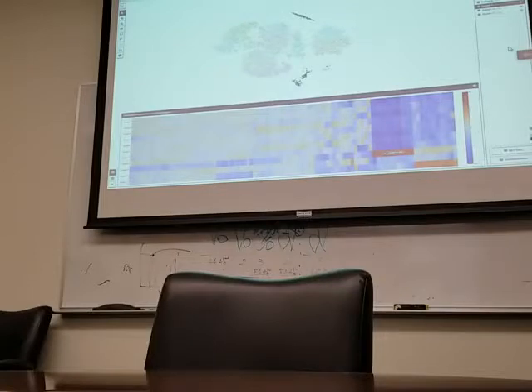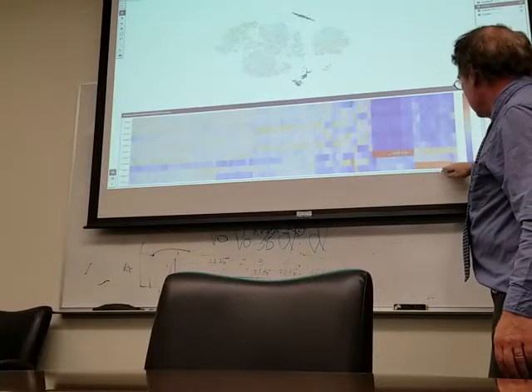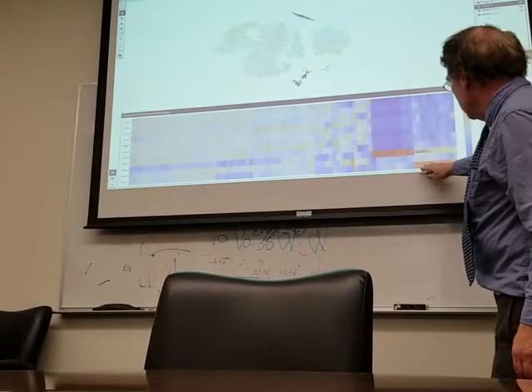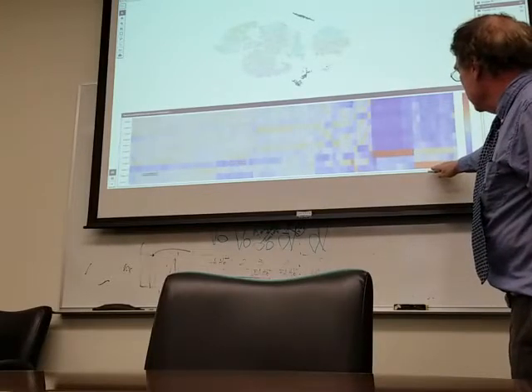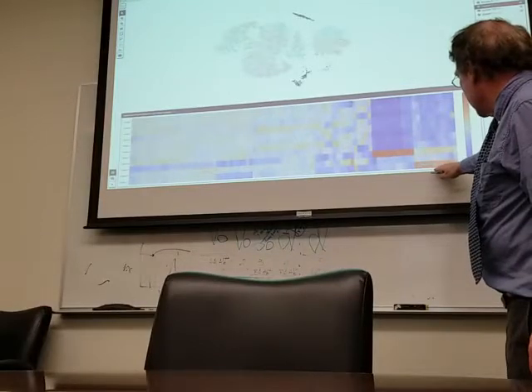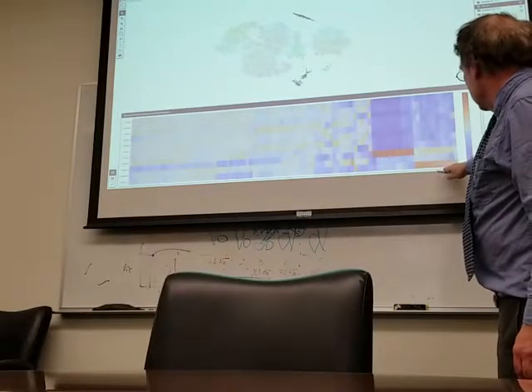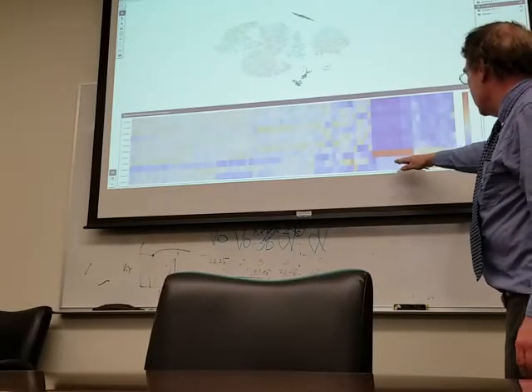And I guess this one here. So I saw lysozyme and some other genes. What's this one down here? Oh, you can't see. Cluster 11. There's another bunch of red. Can you mouse over this one? I don't know. Okay, it's cluster 11, the red one, down here. That's probably T cells, I guess, because it's not lysozyme. I can't tell. So CD7, IL-32, they are T cells. So you can tell those are monocytes, macrophages, and these are T cells.